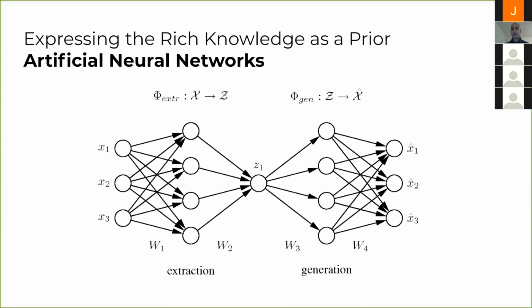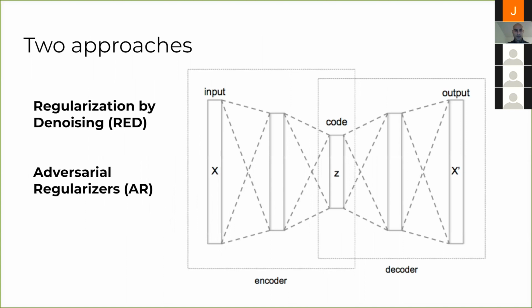And it turns out that we have a lot of data, right? And now we have this framework, convolutional networks, that we can use to plug that data into our reconstructions. This has been done before in image reconstruction through multiple different ways.